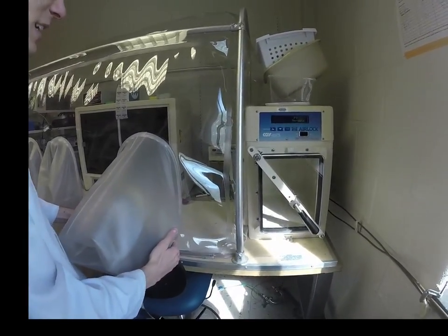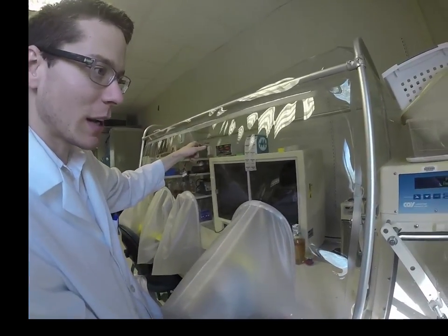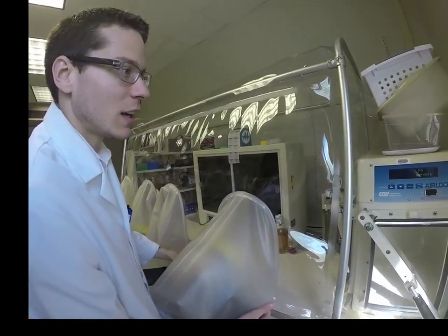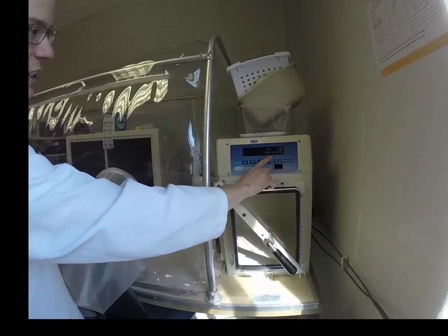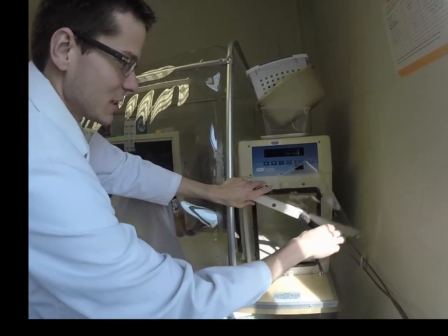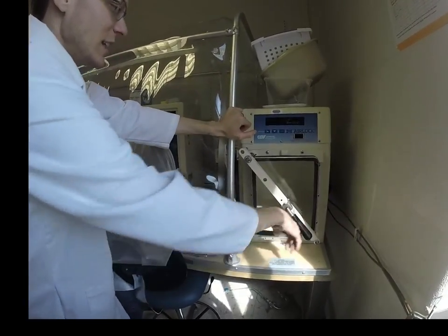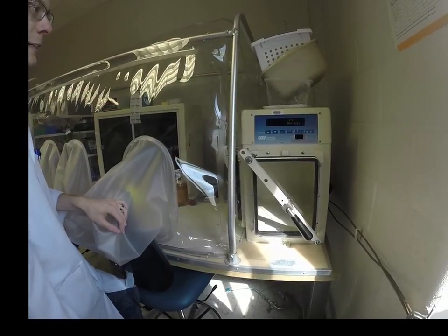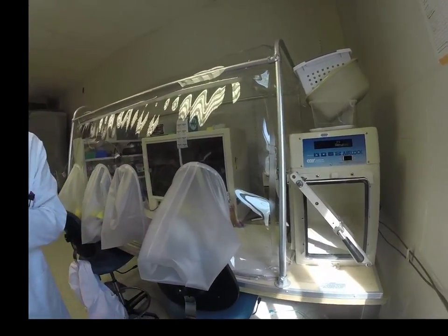Okay, so as I said, we have this problem that the hydrogen concentration is 0 at the moment. We need to get that back up to about 1. And as you can see, if you look at our airlock again, the door is currently in aerobic state. That means that this outside door has been opened. So it says aerobic because there's essentially air in there at the moment. But before we can reload the chamber, the gas cylinder is empty.